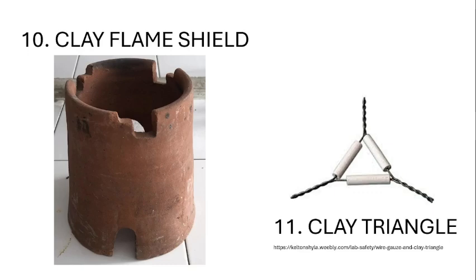So it is used to deflect the air. Our lab is windy because the windows are supposed to be open while conducting experiments. So this is to avoid also spreading of the flame from the burner, to protect the people and the things surrounding the setup.